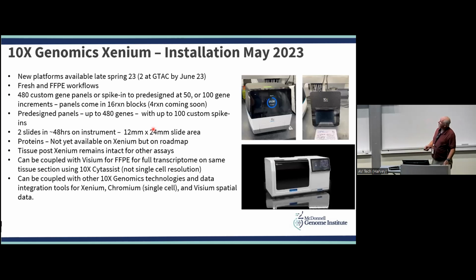And then 10x Genomics Xenium, and I'll save you the surprise. This is the platform that we ultimately went with. We installed the first right at the beginning of May, I believe it was 2023, and we had a second by June of 23. It does have a fresh and a FFPE workflow. So these are hot off the presses, actually.